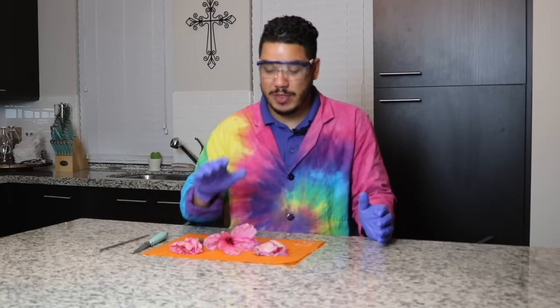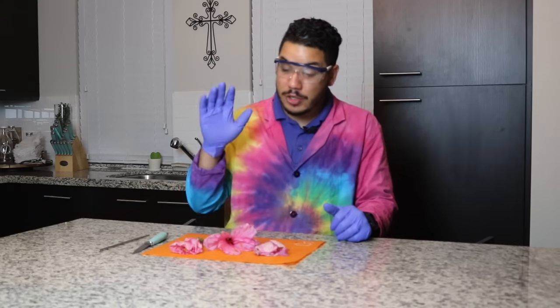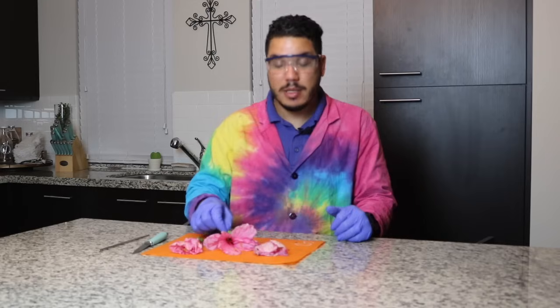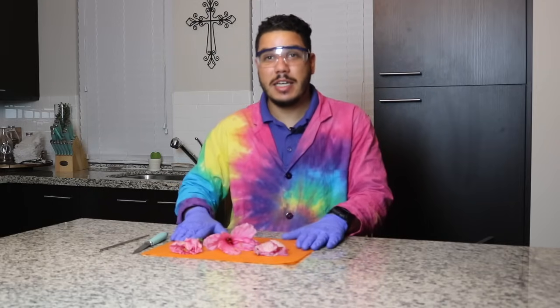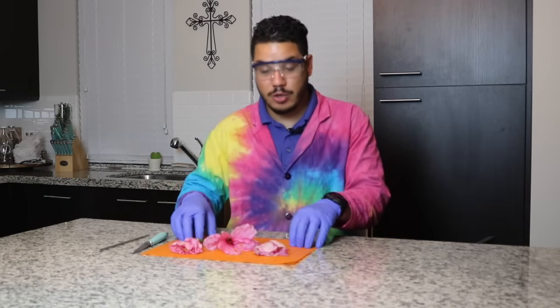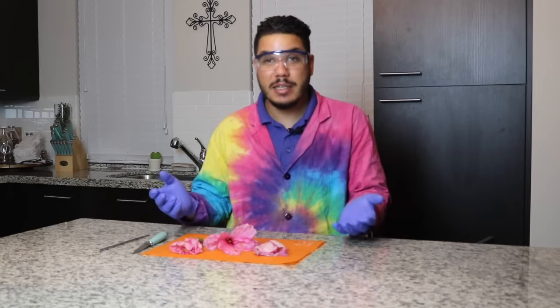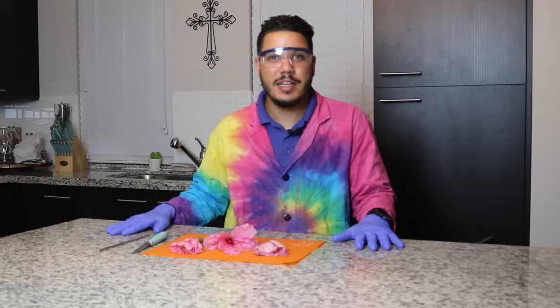I'm only using this because I want to give the best cuts possible on the camera for you. You're going to need your flowers, and I have a flower bud as well that we're going to be dissecting. And of course, a nice clean cutting surface — I'm just using an old cutting board. You can use a paper plate, a plate that you're going to wash afterward, or even just the counter works fine.